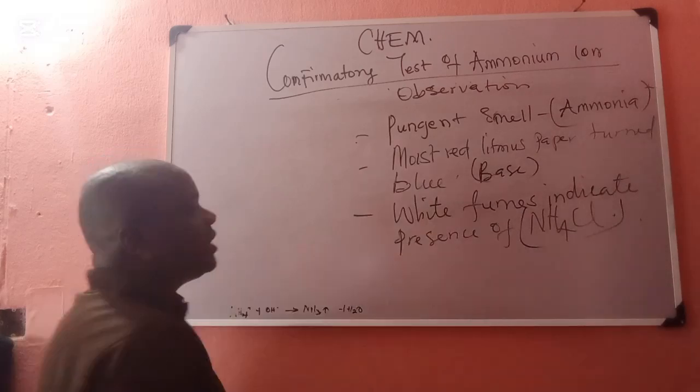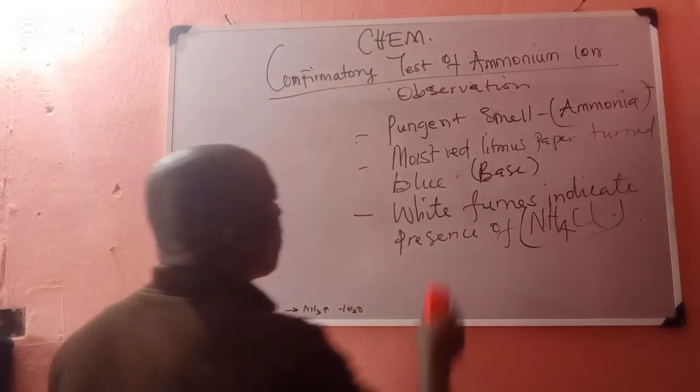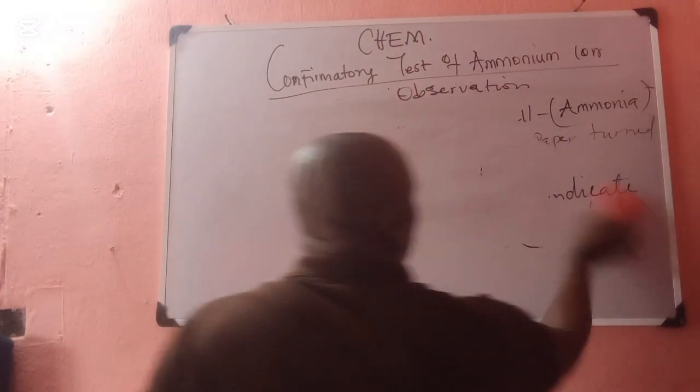So all these three parameters indicate the presence of what? Ammonium ions.